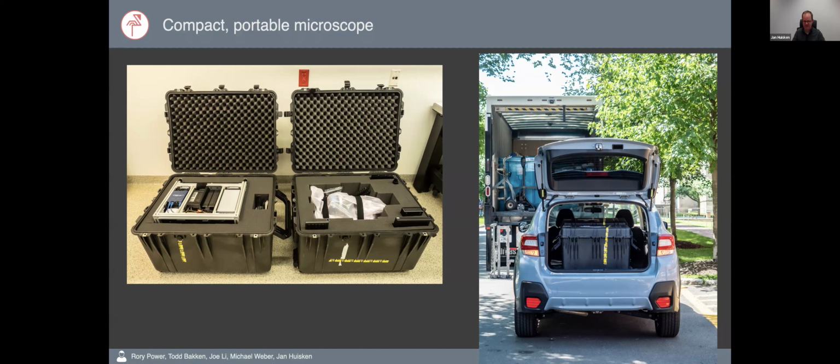Because you need to maybe move things around a little bit and prepare the table and find an outlet and hook it up to the network or set up the Wi-Fi. But generally, there's also no major realignment one has to do. So I'd say in an hour, you typically have the system up and running. So it's really plug and play. Yeah, I would say so.